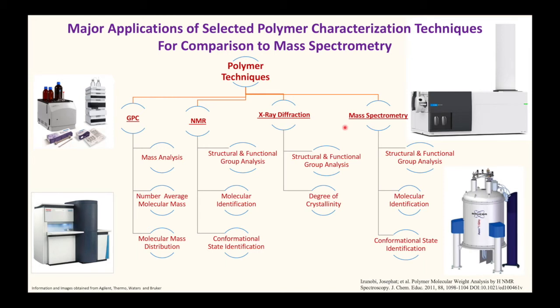Which technique performs these tasks better will depend on polymer choice, instrument capabilities, such as the method detection limits and sensitivity, as well as other analytical constraints concerning the sample matrix, all important considerations that can be limiting for most colligative methods. It is important to note that NMR is not dependent on the sample condition, unlike mass spectrometry. For NMR, we can use a minimal sample volume. Sensitivity of the mass spec is actually much greater when compared to NMR.